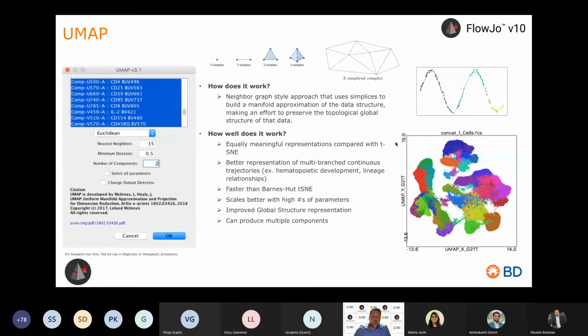Now, UMAP gives you another dimensionally reduced data space, an alternative to t-SNE, and it uses totally different math, as I mentioned in the comments in response to one of the questions here. Actually, this author, Leland McInnes, has a great talk from one of the scientific conferences that's available on YouTube describing the math.